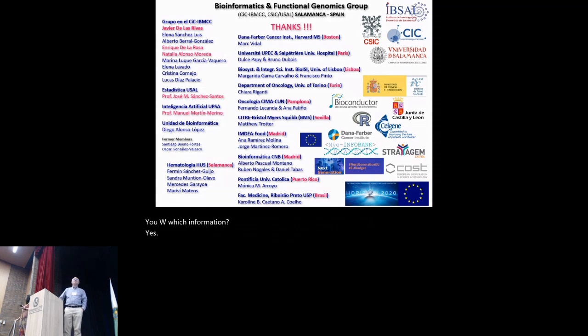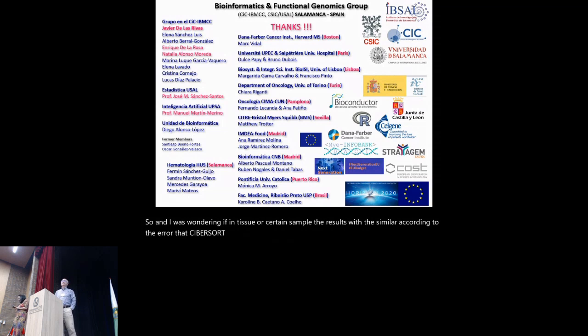And so these results that we observed in the presentation were observed in a liquid sample. So I was wondering if in tissue or solid sample, the results would be similar according to the error that CIBERSORT is showing. So the nature of the sample can affect the estimation made by CIBERSORT.